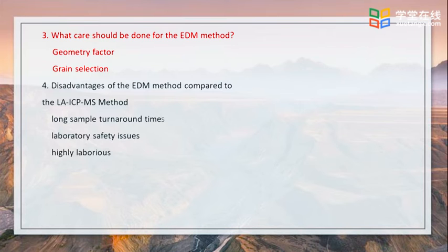Moreover, the procedure is highly laborious, with long hours needed at the microscope to measure the track densities and confined track lengths required for each sample.